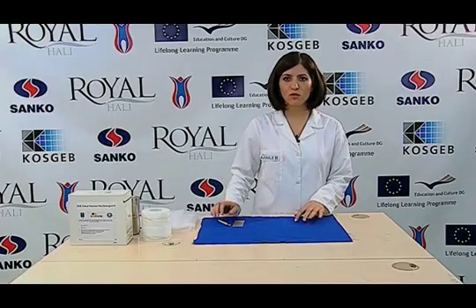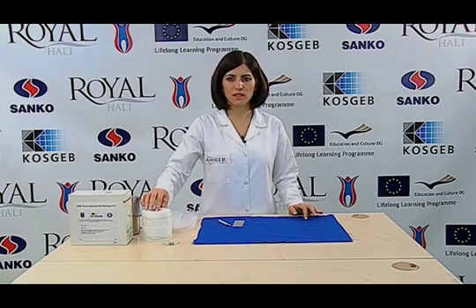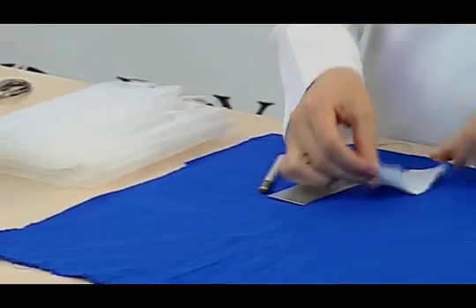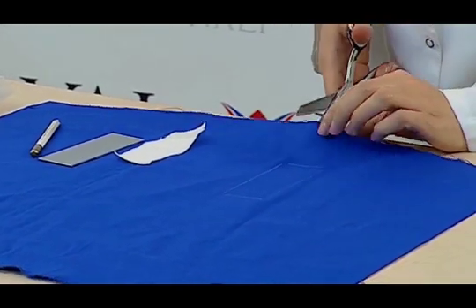A multi-fibre adjacent fabric is prepared at 40 mm by 100 mm in size. The test sample and the prepared multi-fibre adjacent fabric are sewn face to face along the short edges.